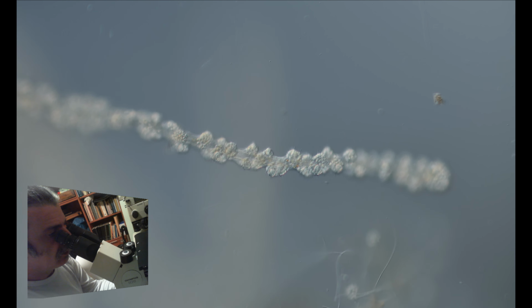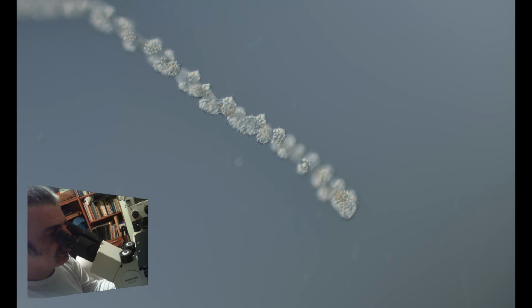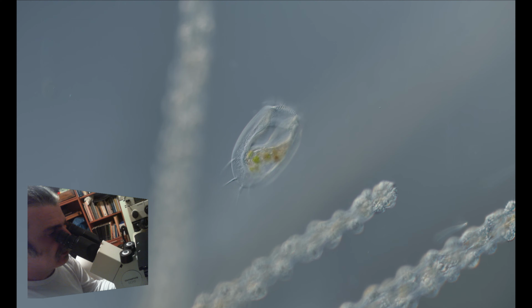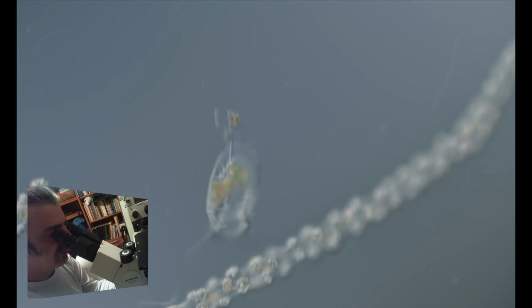Here, you can see right now with more details the spikes that transfer the venom from the hydra's tentacles, like a cactus. Not all the creatures are affected by this venom.